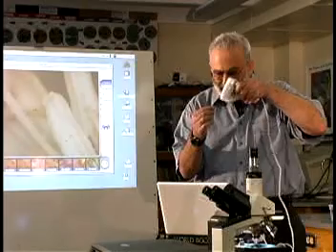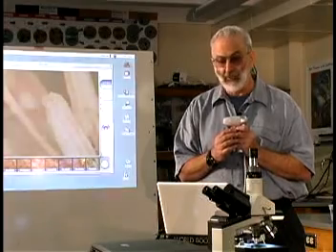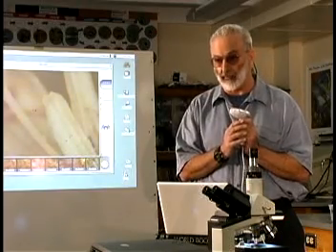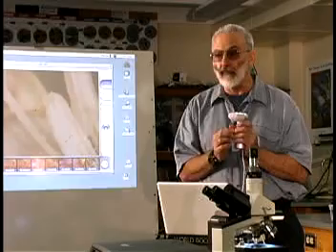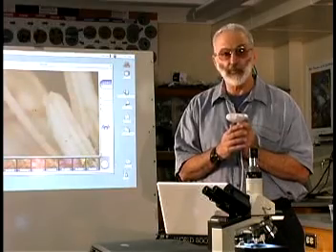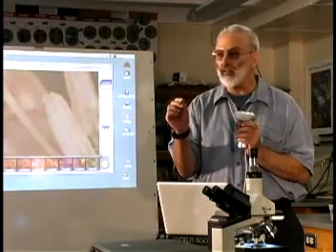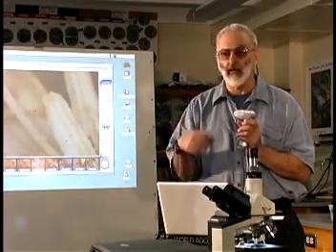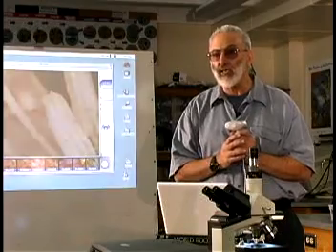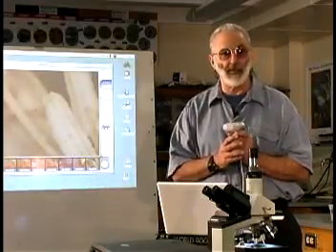Then I want you to look straight down inside the flower so that we can see the male and female reproductive structures. Then we can open up the flower by moving the petals to one side, or even removing a couple of the petals, and take a nice image of the male part and then another image of the female part. Afterwards, when we dissect the flower, we'll take an image separately of the stigma, then the style, then the ovary, and then again the anther, and then the filament. Later on, we can open up the ovary and look inside at the ovules and the carpels. So we'll have a complete picture of all of the parts of our plant.